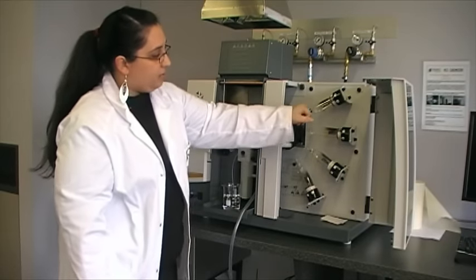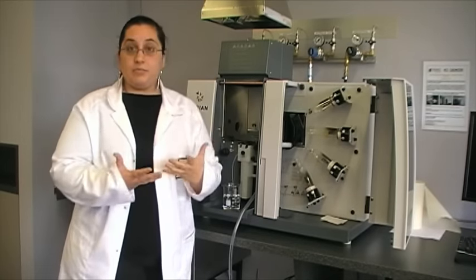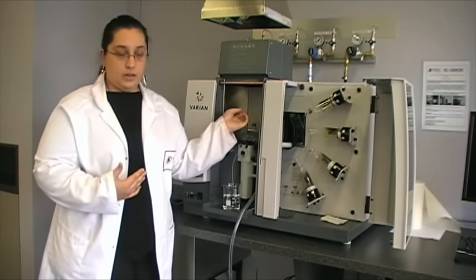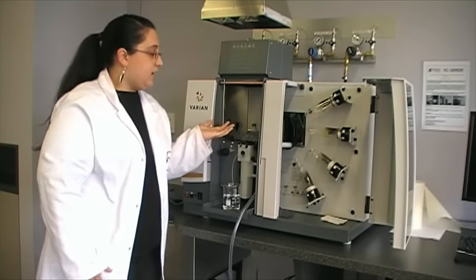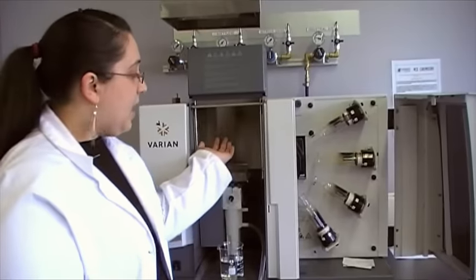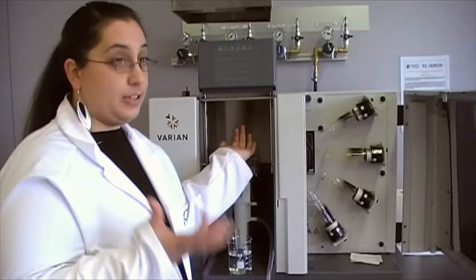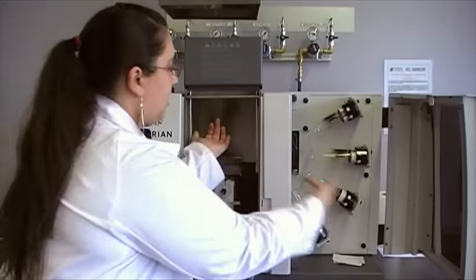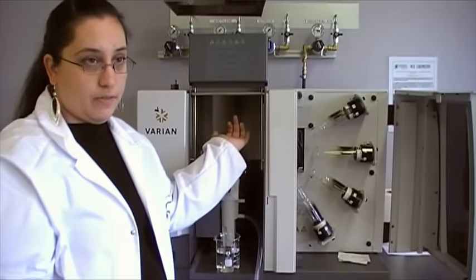So our light will be generated from this lamp at set wavelengths and will then be able to pass through our sample. So at the moment, what we will have is a range of different atoms and ions burning in our flame. And as we pass the light through, that light is specific for a particular element. So if I was looking for magnesium, a specific wavelength of light is going to be passing through my flame.